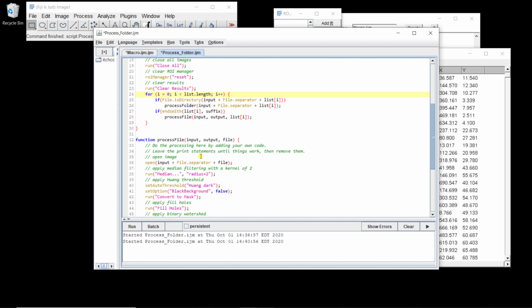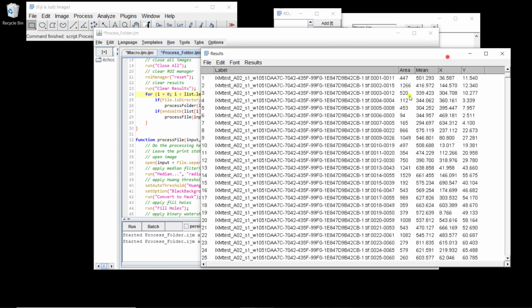So that's one thing. Now the last thing that we haven't yet done is to have some output. So this will be our output with all the measurements. The risk when you do that is that you don't see what you actually do. There are several reasons. Maybe your pipeline is not suited to all your images, and you're going to process some images partially or not the way they should be, and if you just look at your result here, there's no way you can know.